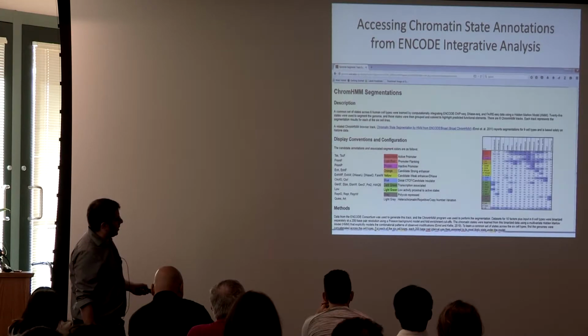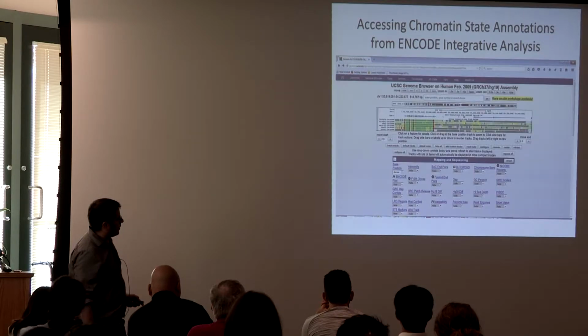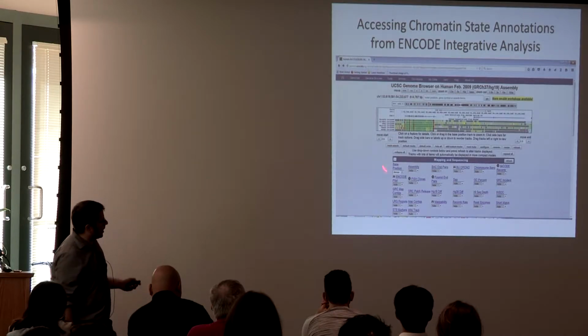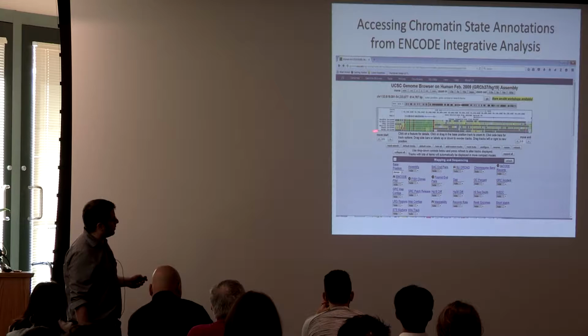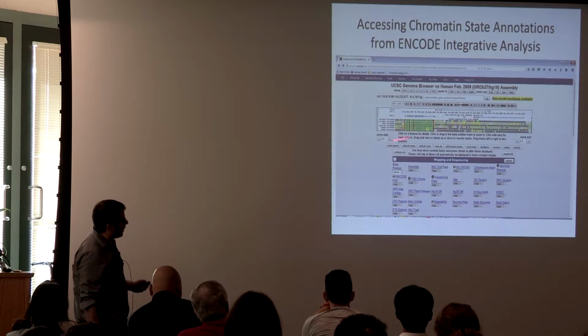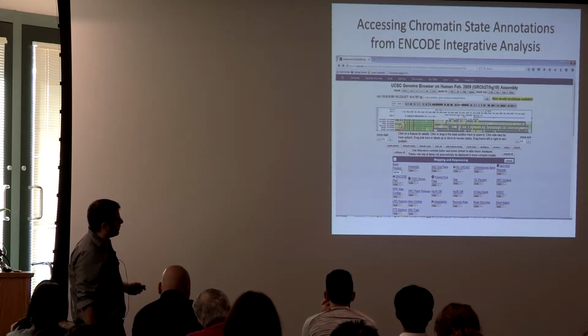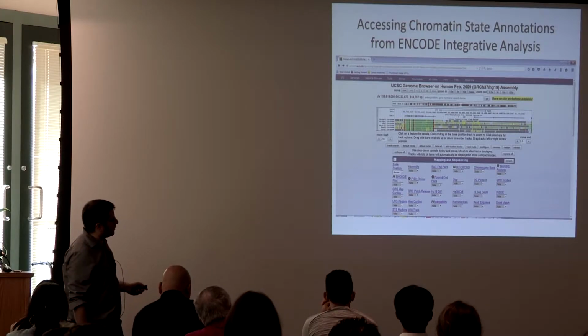It's talked about more in the references I had given you. Similar to before, if you go back to the browser, then you can pull out these 6 cell types in their chromatin state annotation. It's roughly similar color coding as before, with green being the transcribed regions, gray more repressive, yellow enhancers, red promoters, blue insulators.